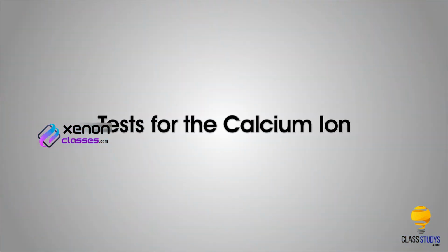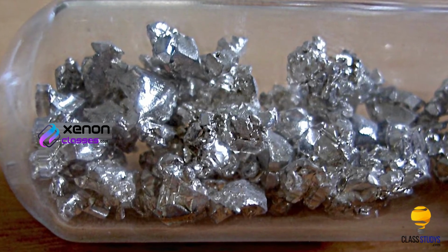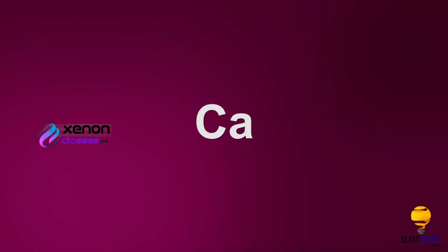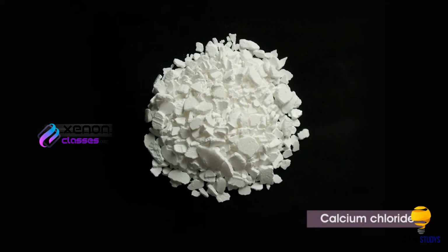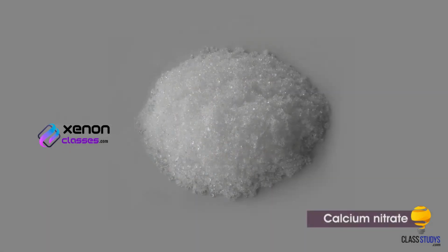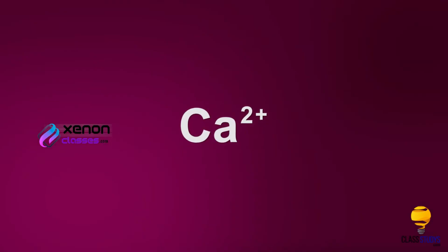Tests for the calcium ion. Calcium is a soft grey alkaline earth metal with symbol Ca. It is found in various salts like calcium chloride, calcium nitrate and calcium carbonate as calcium II+ ion.